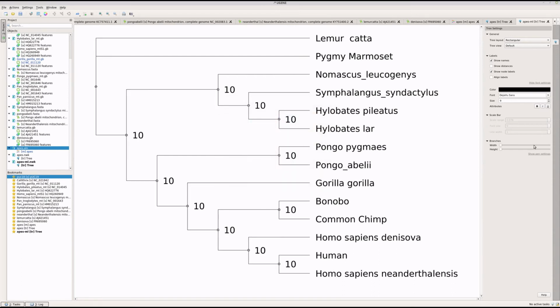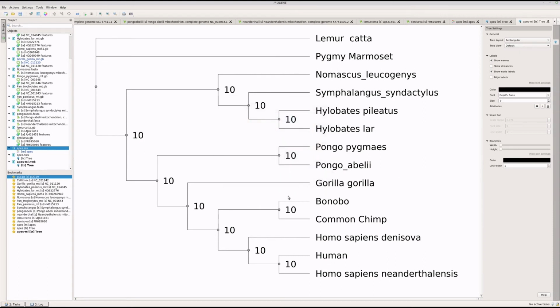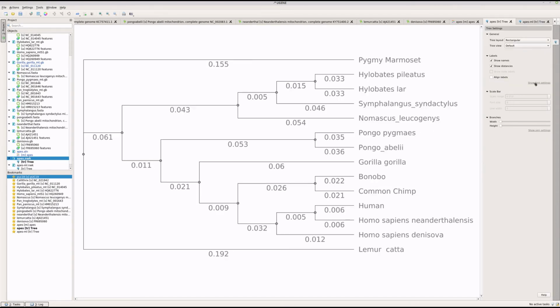Yes, much better. And also you can change things with respect to the other pen issues. Fortunately, other things are already in black, like these lines. You can change the thickness of things. The line width can be increased, right? And essentially, what you do see here are some numbers, once again, and we saw that also with the neighbor joining tree, right? So this is the neighbor joining one.